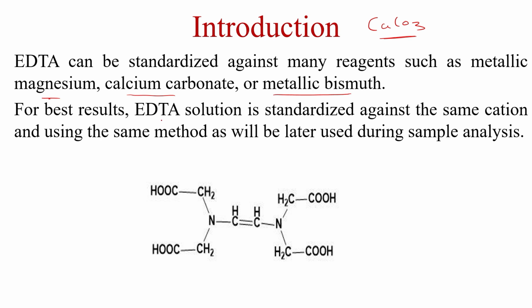But for best result, EDTA solution is standardized against the same cation and using the same method as will be later used during the sample analysis.